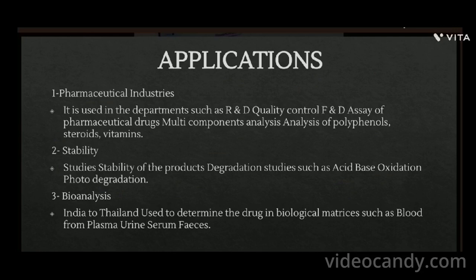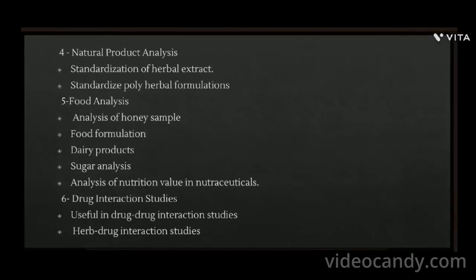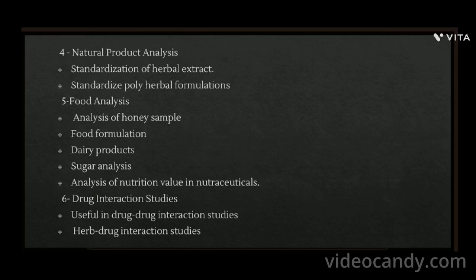Third, bioanalysis, used to determine the drug in biological matrices such as blood, plasma, urine, serum, feces. Fourth, natural product analysis. Standardization of herbal extract. Second, standardization of polyherbal formulation.